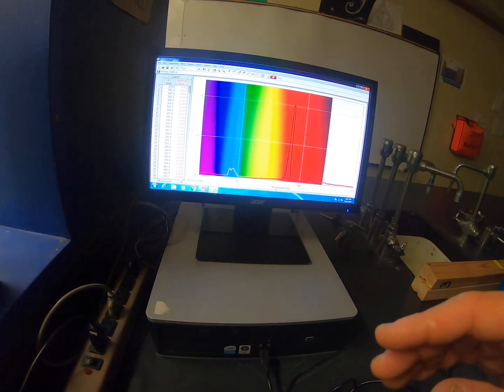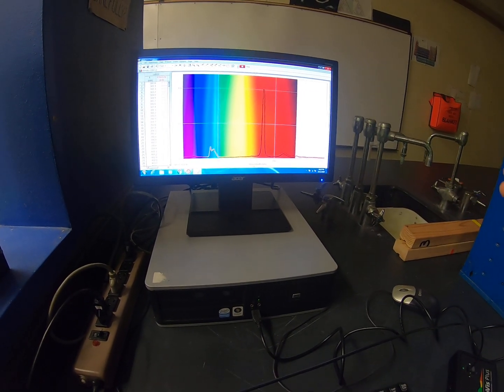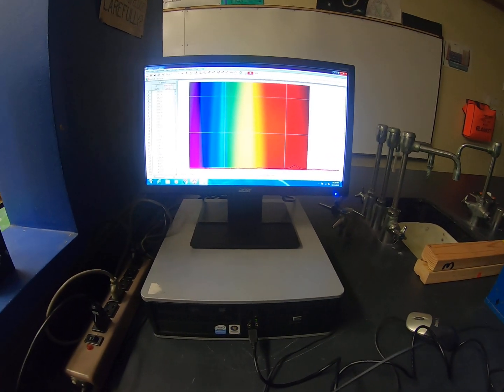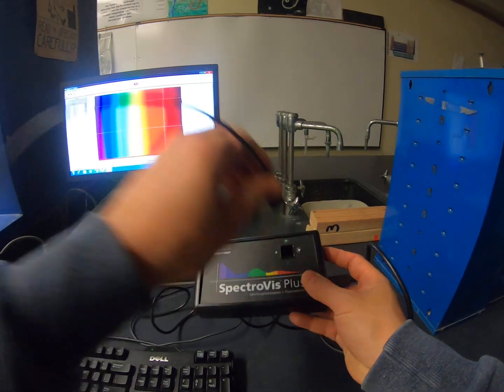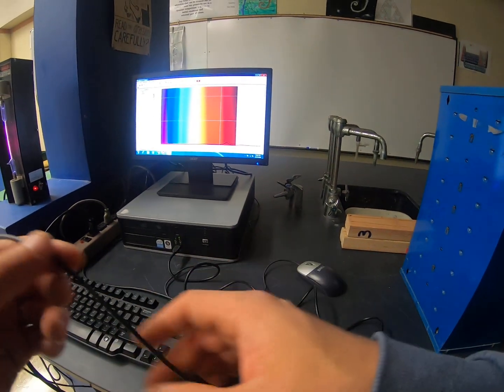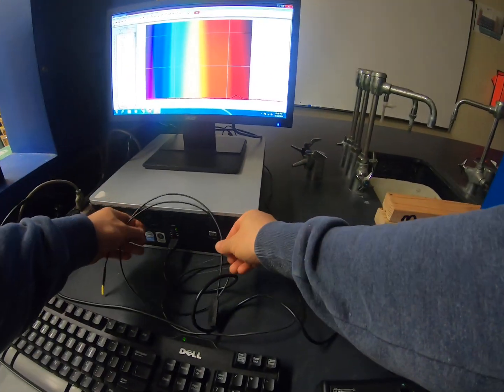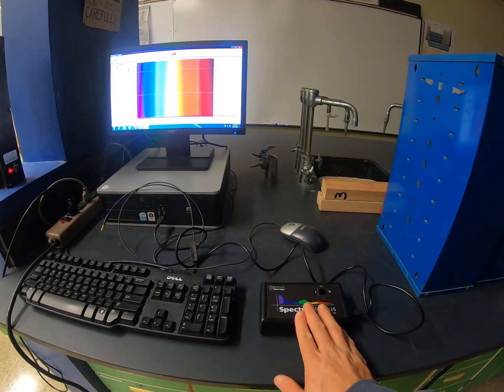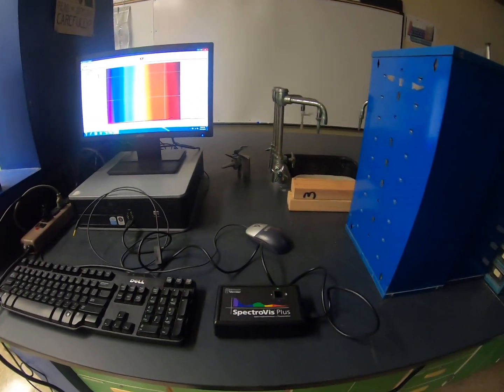So again, spectrophotometers give us a good way to identify light, and we can measure all sorts of different kinds of light: visible, infrared, ultraviolet. We have special telescopes that are looking for radio waves, and again, they're hooked to a spectrophotometer, just like this, just a little more complex. But this is a really important piece of lab equipment that we use, and spectrophotometers are foundational for chemists to identify and quantify chemicals that they're producing or chemicals that they're looking for. So we won't get to use it a lot in this year's chemistry, but if you take AP chemistry, we'll do a bunch of work with spectrophotometers.